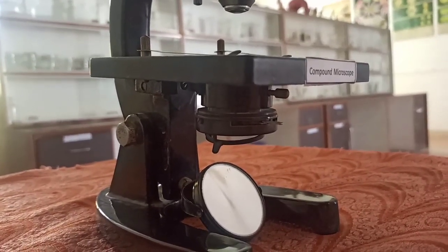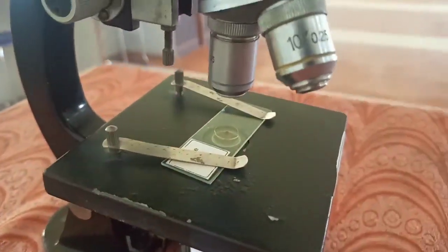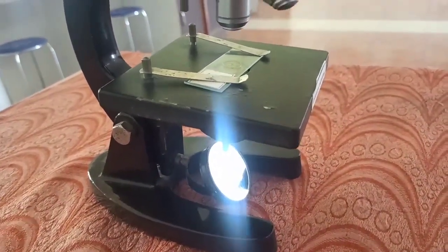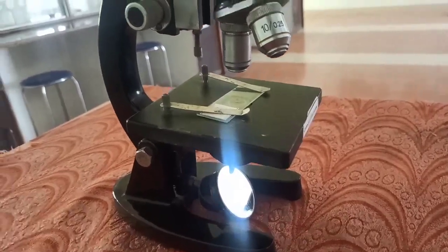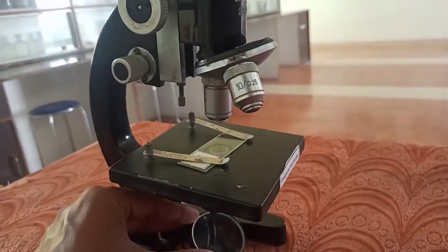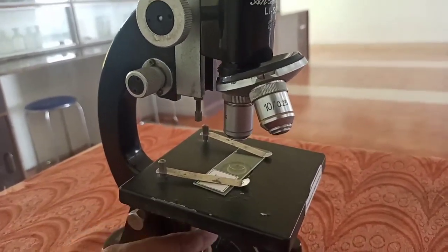A single ray, or a single cone of rays, should pass on the stage so that the object is visible. Now the reflector is shining, which means that light rays are falling on it. From this side, if you observe, the reflector is shining — light rays are falling. And if we have the light rays, we can transfer them so that light is directed onto the stage.